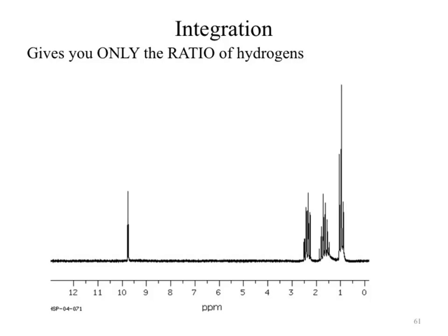Okay. This is why when we look at integrations very typically, that information is given to you in some interpretable fashion. That said, the ACS has not developed to that level, and they really only expect you to look at peak height. Okay? So if we were to look at an individual spectra like this, we would try to come up with some information on how our integration stuff is supplied. So take a guess. Okay. We have one signal massively taller than the others. Okay. How many hydrogens do you think are represented there? A lot or a little?